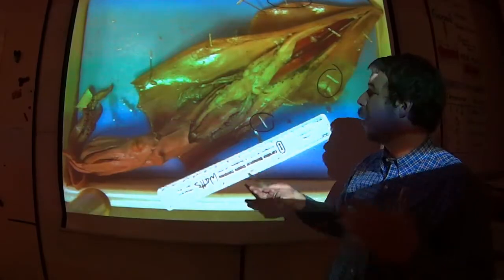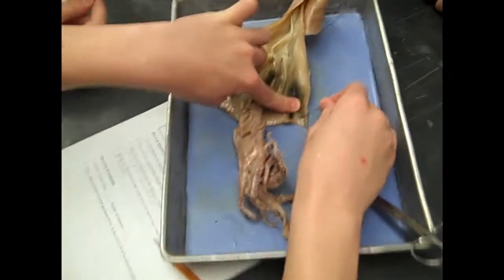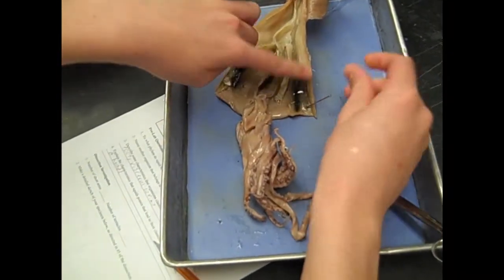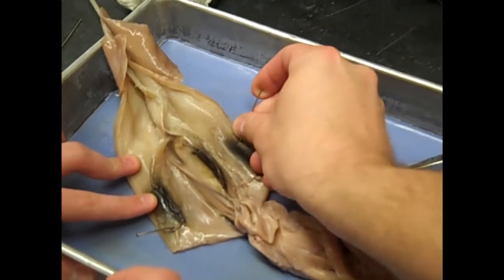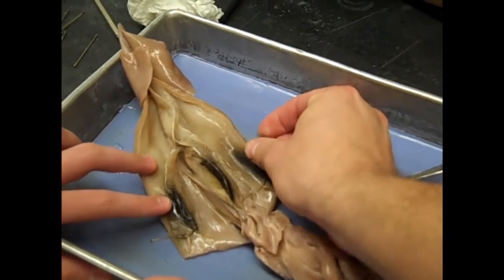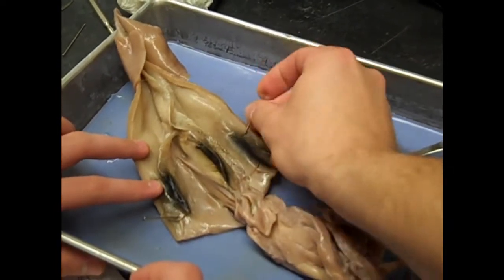You want to make sure that your pin heads are really out at a nice extreme angle. That way it is all out of your way. This thing is rubbery. That's what you meant. So that's what you meant by extreme angles. And even more extreme. Let me see one of those pins. Like basically sideways? Yeah. So you take this pin and pretty much sideways you can actually stab it through the rubber.